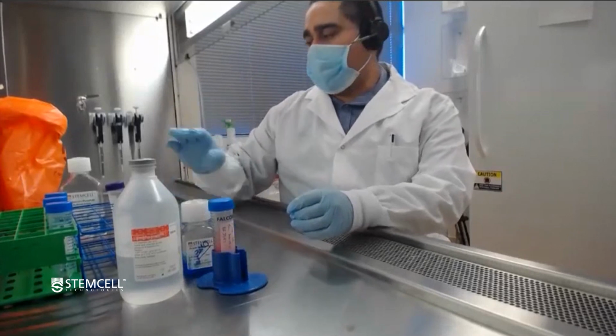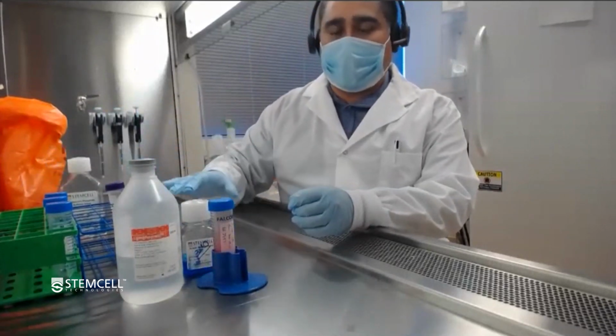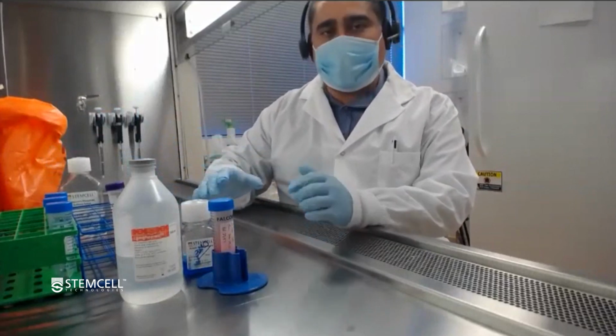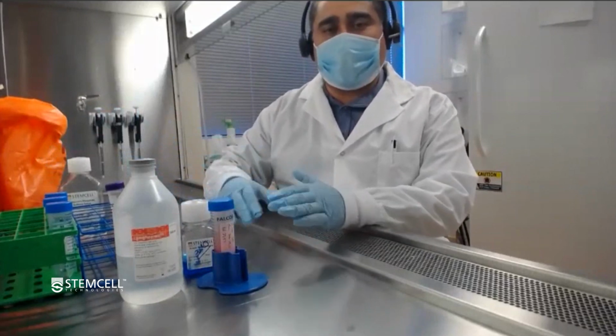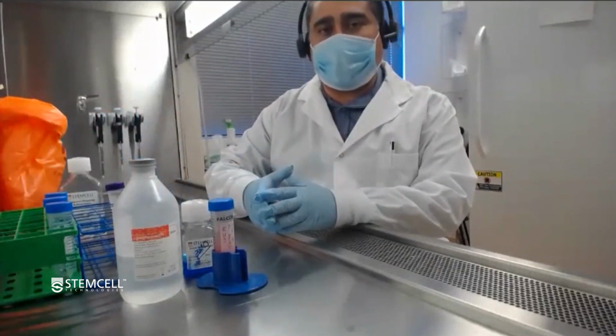The other consideration, which is important, is to make sure that all your reagents are at room temperature and that your centrifuge is also at room temperature. You don't want it to be cold because that will impede the ability of the density spin to happen.